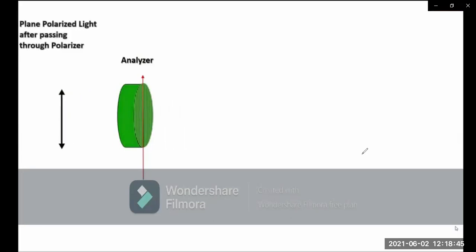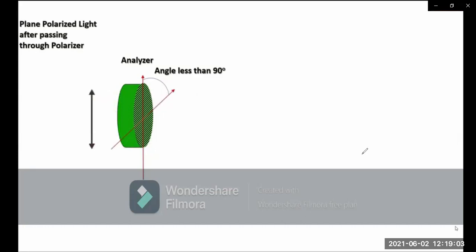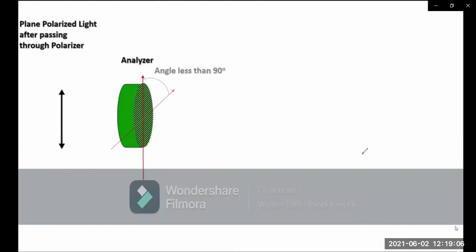This is plane polarized light after passing through the polarizer and analyzer. This is the instrument of the polarimeter. This is the angle of less than 90 degrees. This is the plane polarized light shape, and this is the optically active substance.